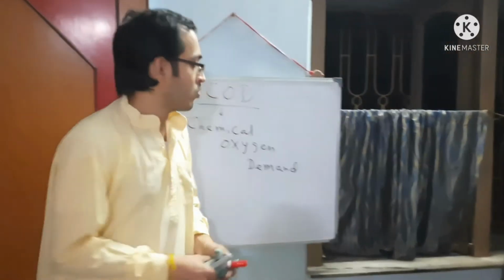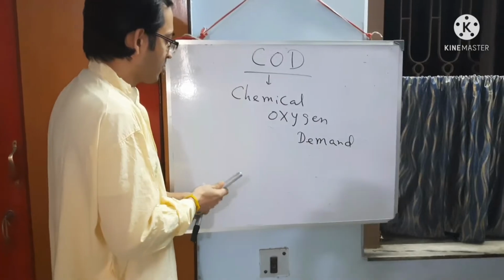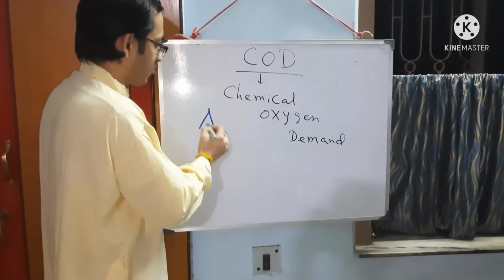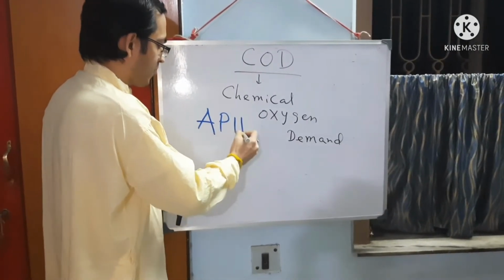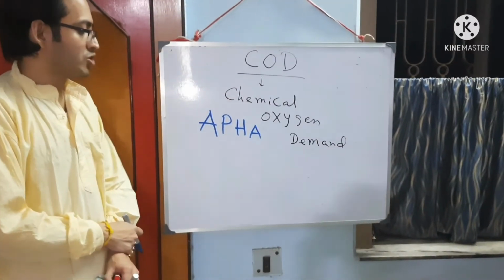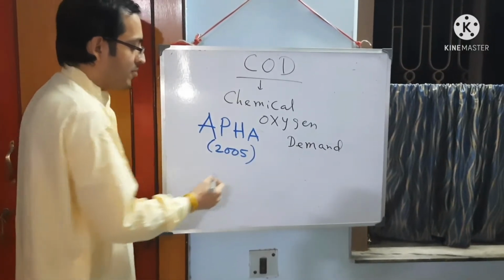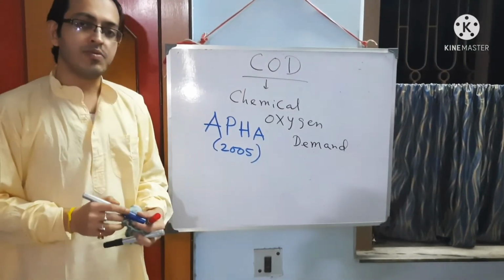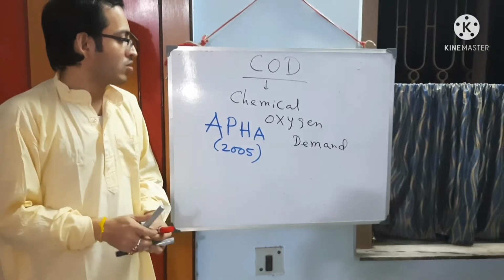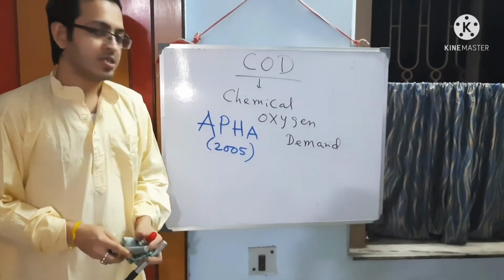For this estimation, the American Public Health Association in 2005 has given us a protocol for measuring chemical oxygen demand.